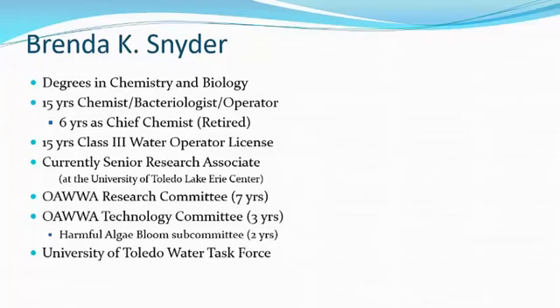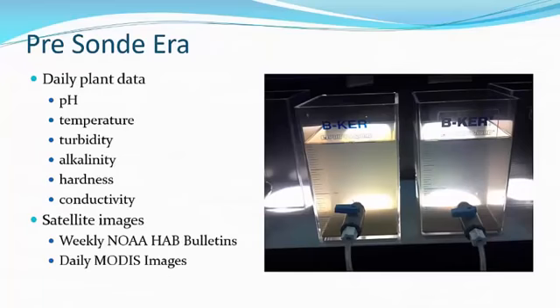My task this morning is to hopefully help those of you who are either not familiar with SONDs or know about SONDs, but not how you would necessarily use them, dealing with blue-green blooms, to have an idea of how they can help you. In the pre-SOND era, before the City of Toledo had a SOND, and they now have 3, but before they had 1 out in the lake, you basically had to rely on your daily plant data.